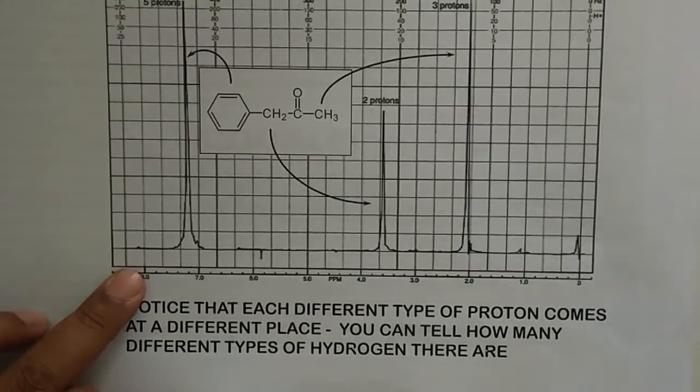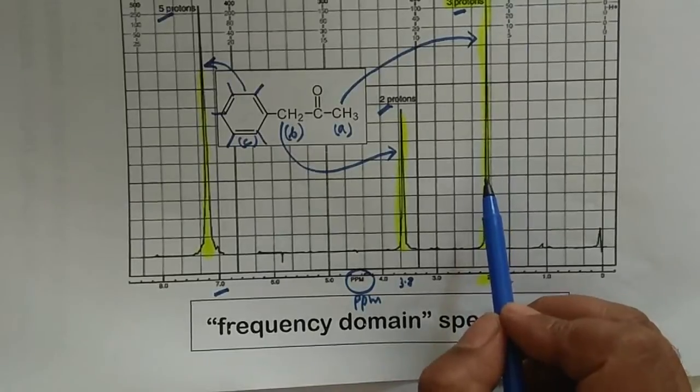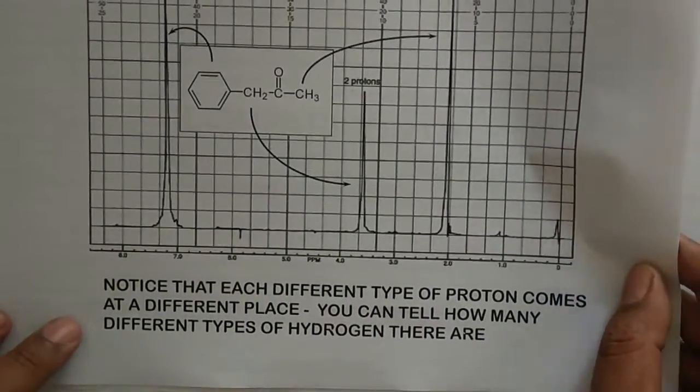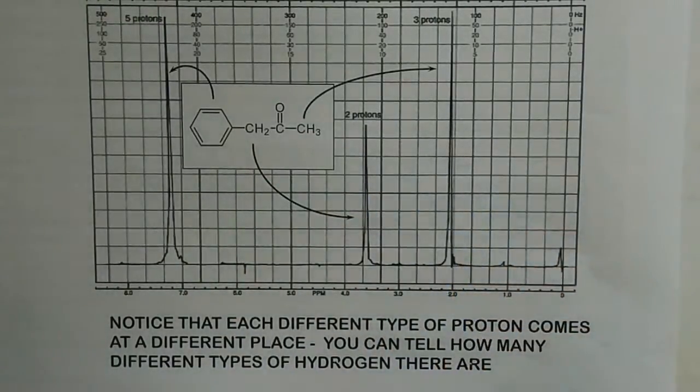And this NMR spectrum, if you compare it with the earlier one, this is the spectrum for the first one, which you were getting through the FT NMR. And this one is the phenylacetone spectrum. So the two spectra are the same. There is no difference in the spectrum for a particular compound whether you use the CW instrument or FT NMR. But nowadays we use instruments with very high frequency.